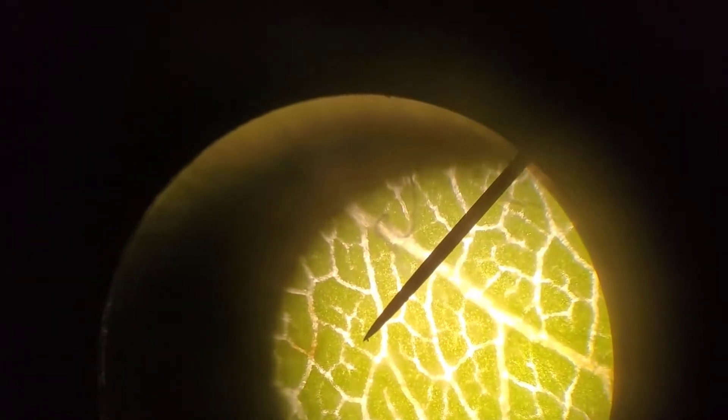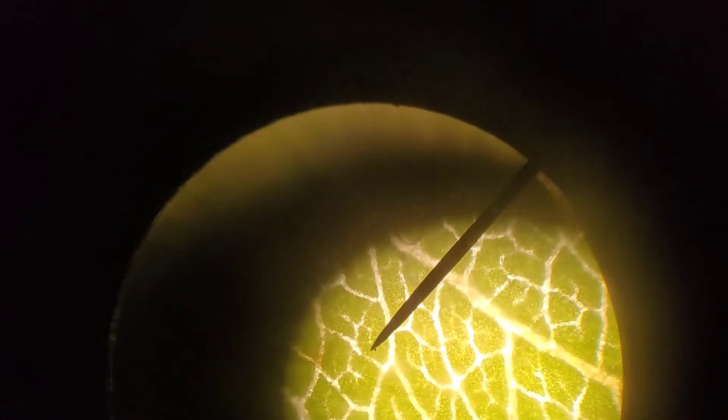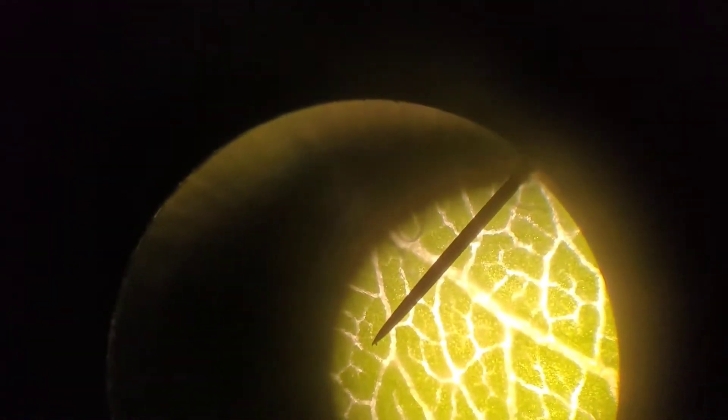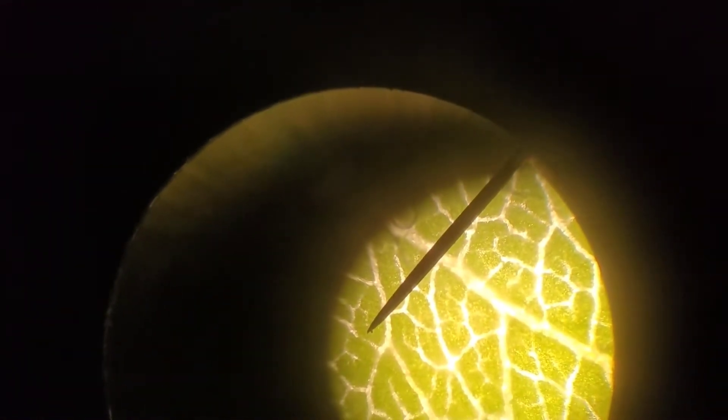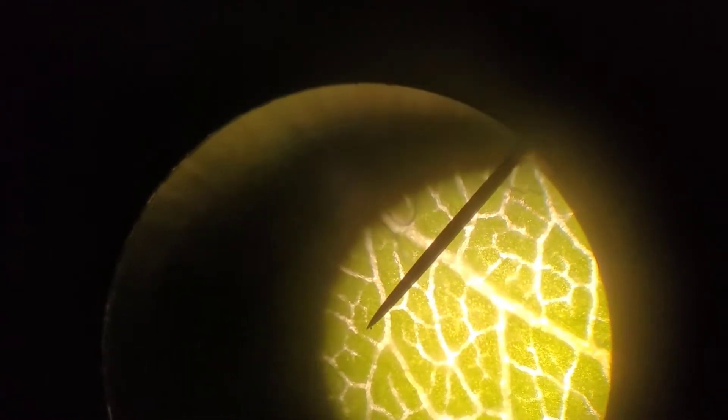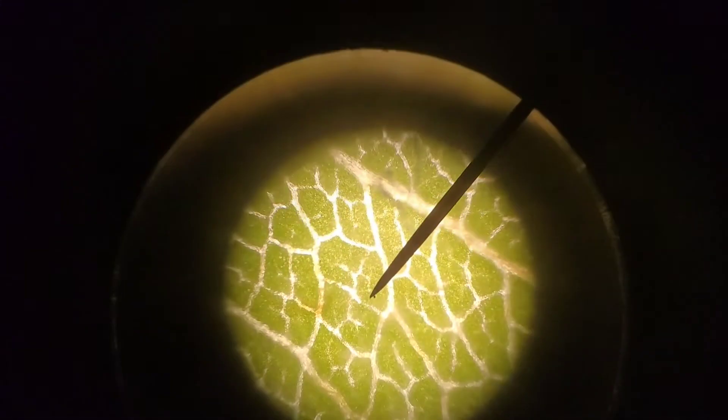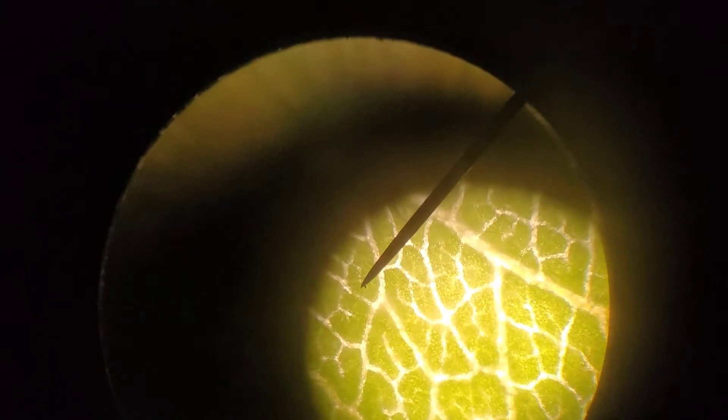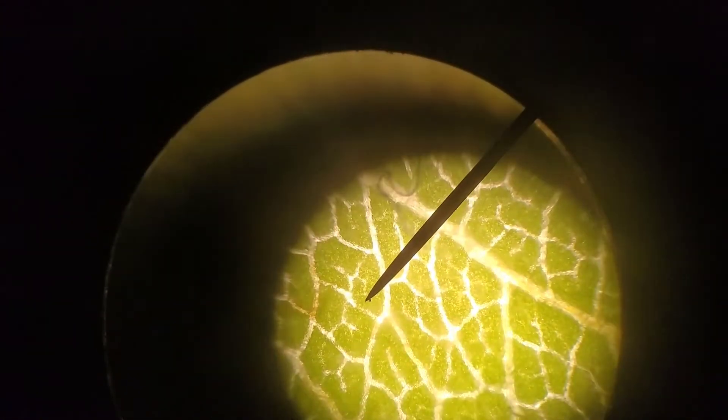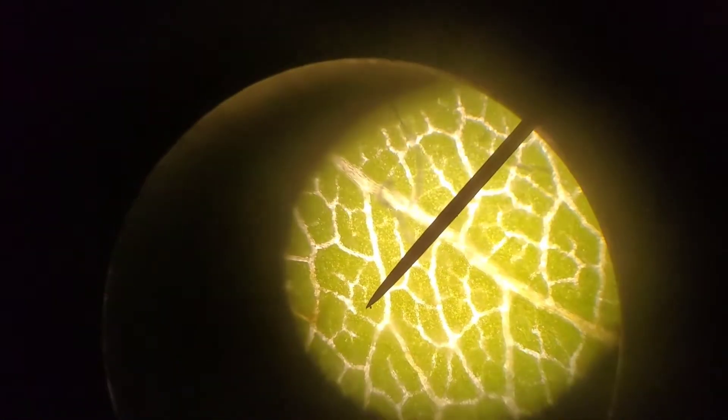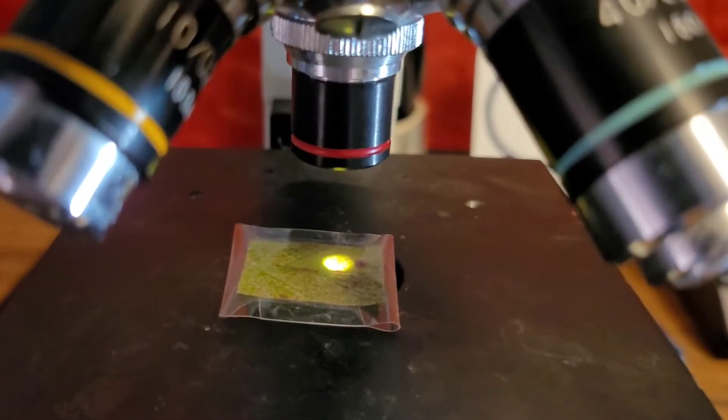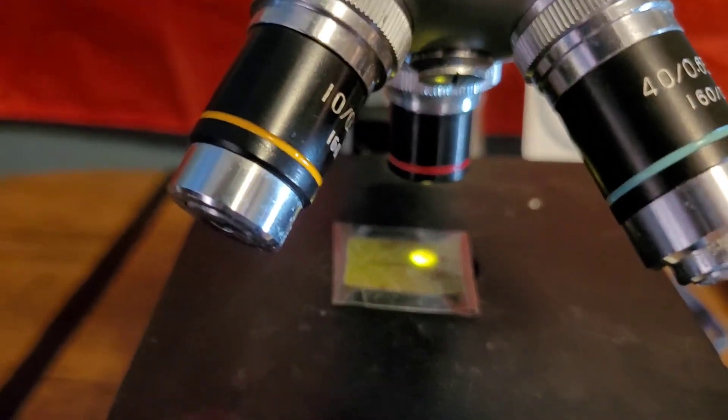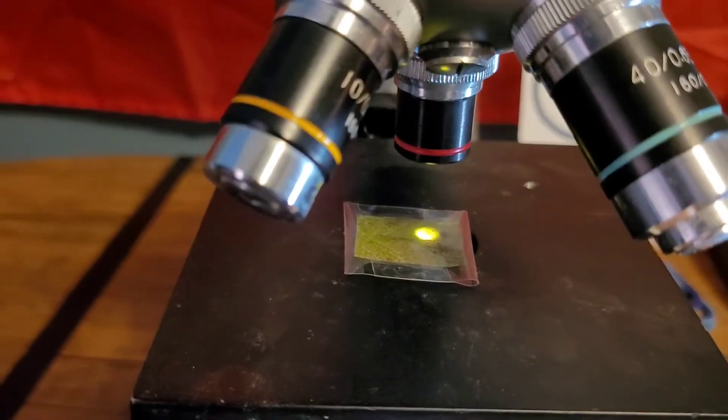There's not a lot going on here. There's all these little white strands, those are veins for the leaf to deliver nutrients and stuff. You can slightly see there's a little bit of an orange spot. That's where it's starting to rot. This one also came off of a weed, I don't know which one though.